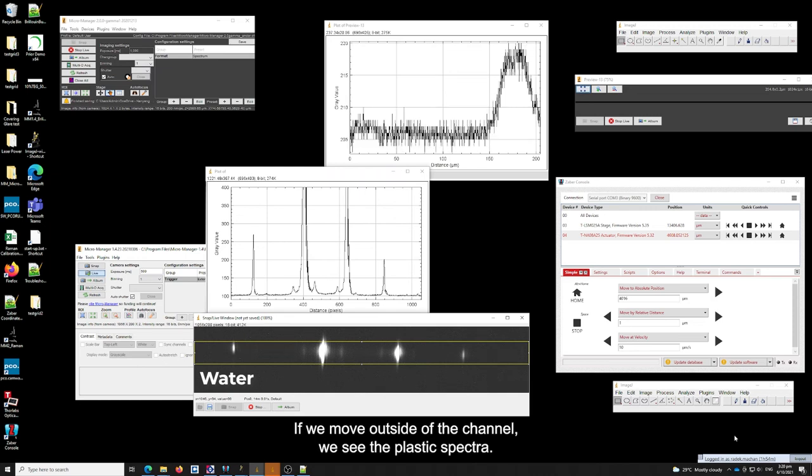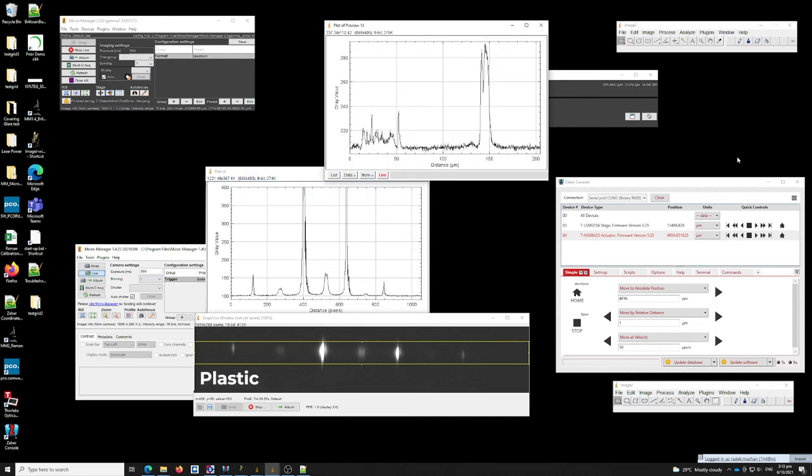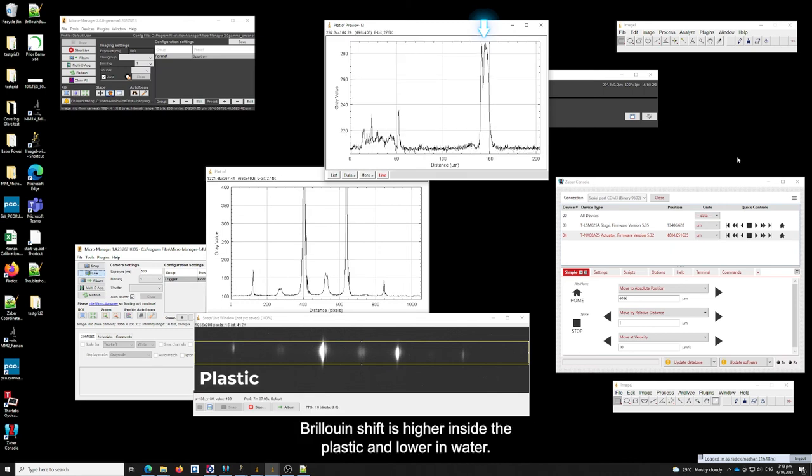If we move outside of the channel, we see the plastic spectra, Raman spectrum and Brillouin spectrum. The Raman spectrum exhibits a strong peak from stretching CH2 vibrations. Brillouin shift is higher inside the plastic and lower in water.